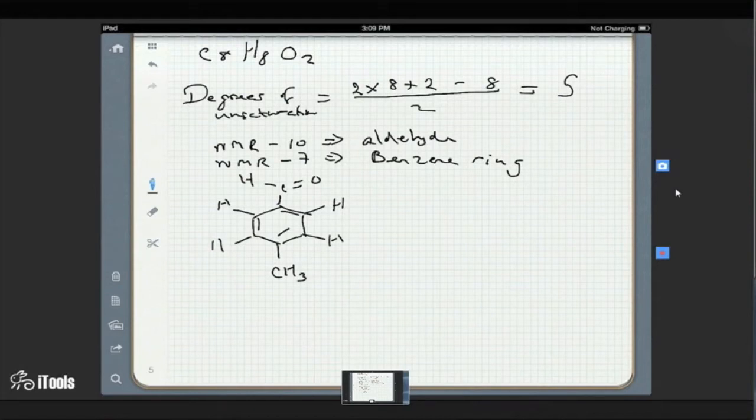I think this is what my answer is, Steve. Okay. Well, why is the ppm for the methyl group so high? Because the benzene ring is electron withdrawing. Okay. Is this right, Steve? No.